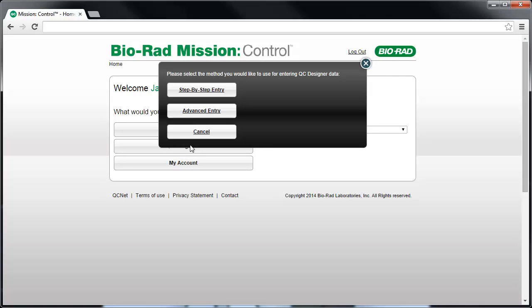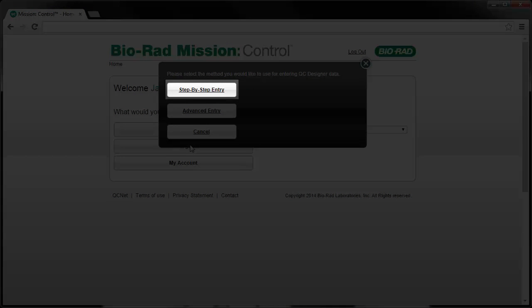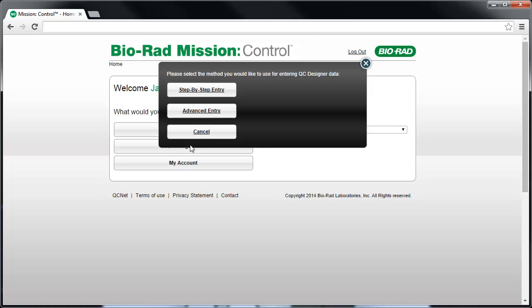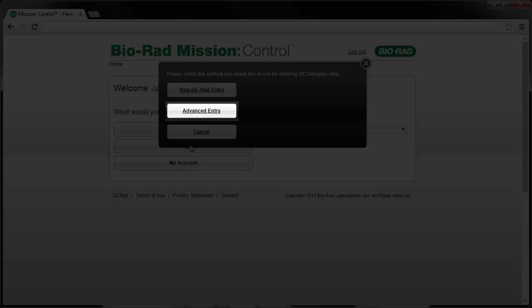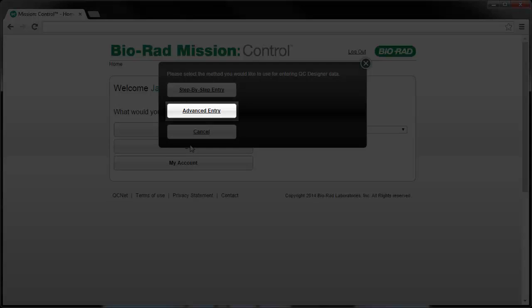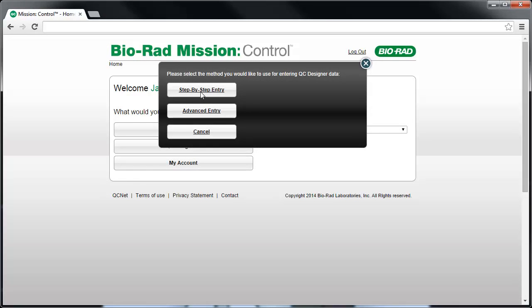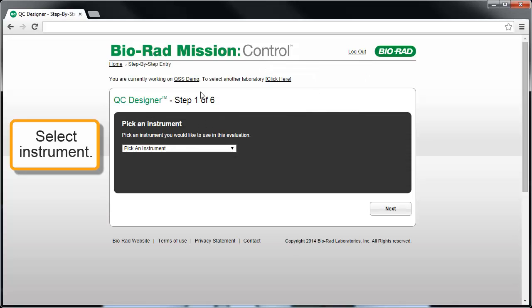Since this is the first time with QC Designer, pick the step-by-step entry method. If you've previously been to QC Designer and have set up your instruments and tests, you would click on the advanced entry method. At the end of step-by-step, you'll be automatically taken to the advanced entry page so that you can perform the appropriate calculations.